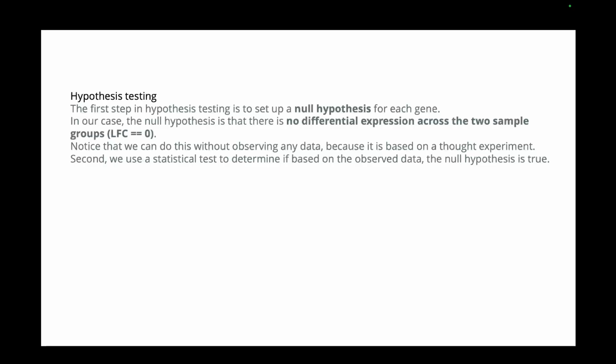As I was saying, you have a thought experiment where you set up a null hypothesis saying that this particular gene is not differentially expressed.